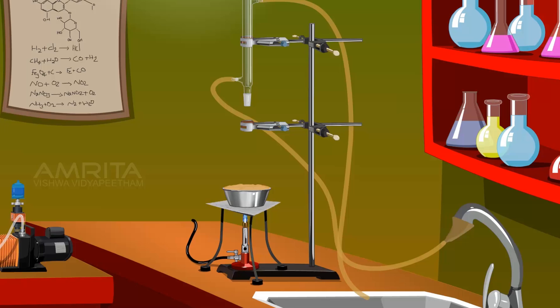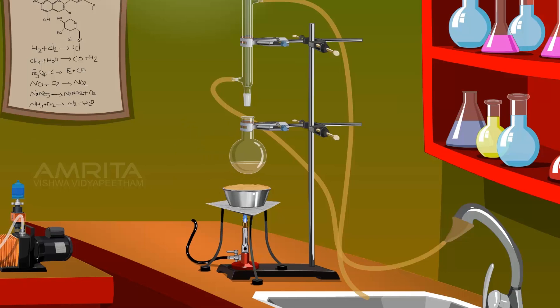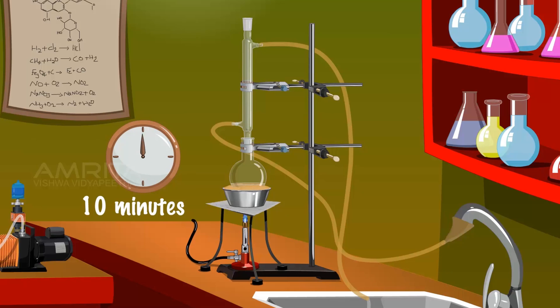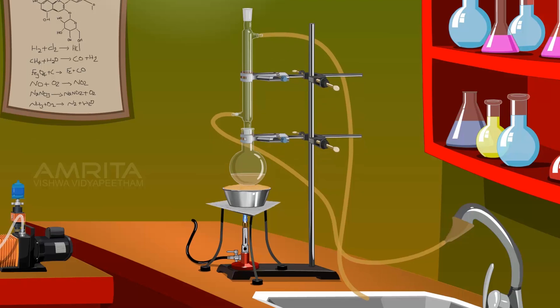Clamp the flask to a stand and fit a water condenser over its mouth. Then place it on a sand bath. Heat the mixture for 10 minutes, then detach the condenser from the RB flask and allow the mixture to cool for some time.